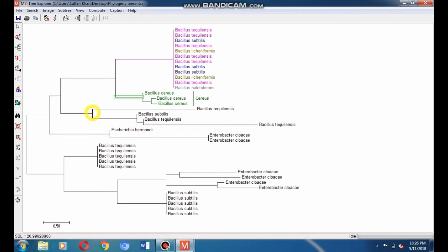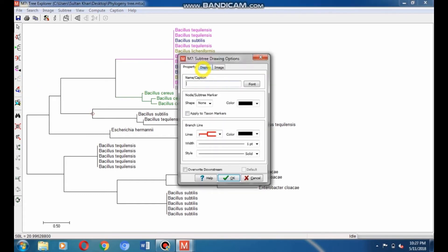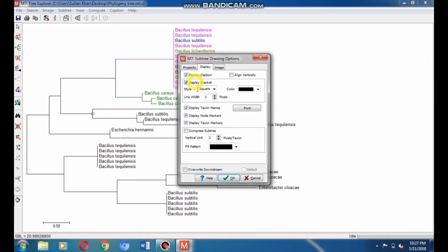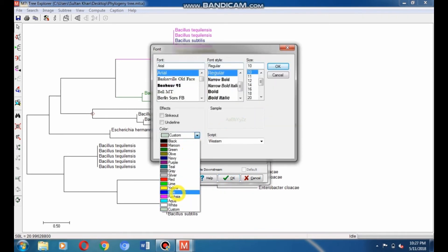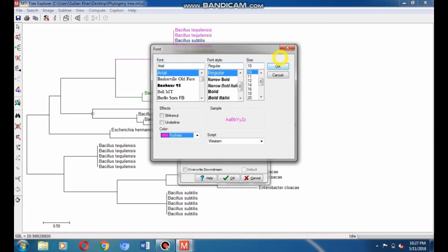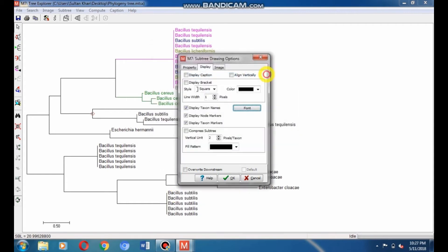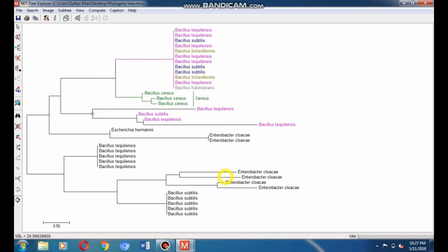Now select the t-consist clade and make it colorful. Put the cursor in front of its node and go to subtree drawing option. Click on Display, select Display Caption and Bracket, and hide the caption and bracket. Go to Font, select color, give it fuchsia color, and then click OK. Now select the subtilis species and differentiate it by giving it navy color.